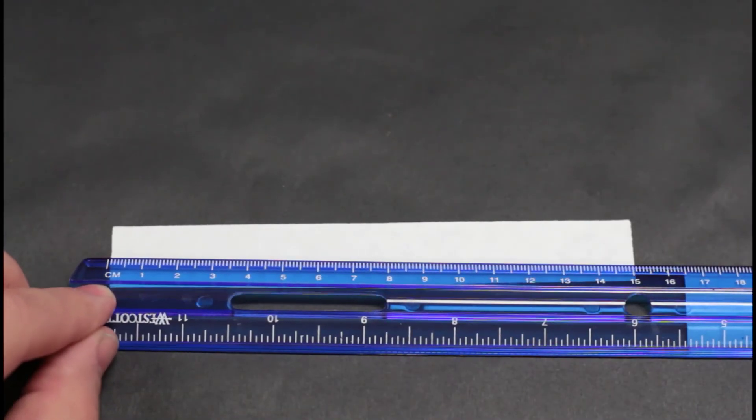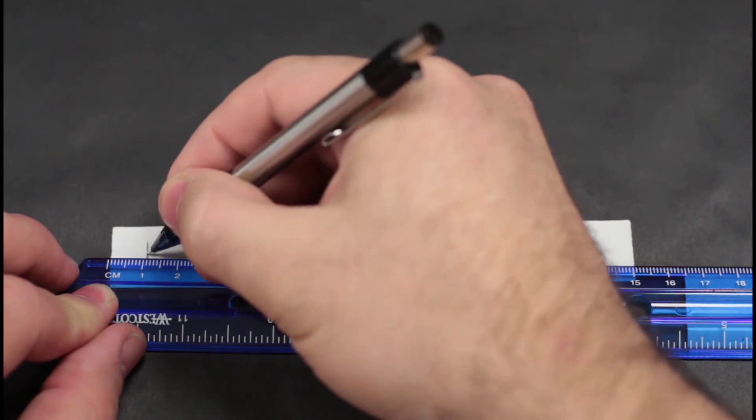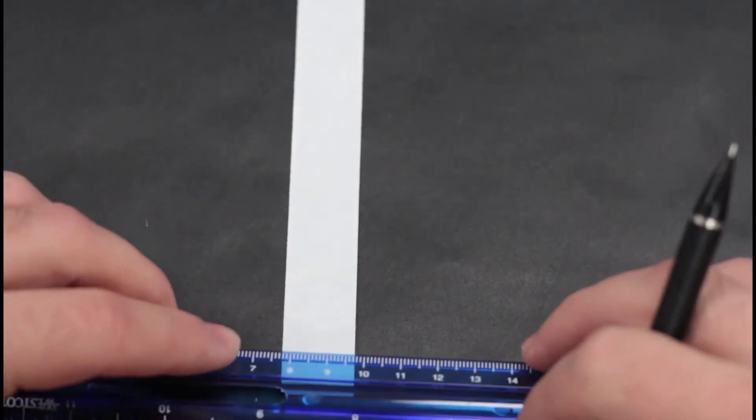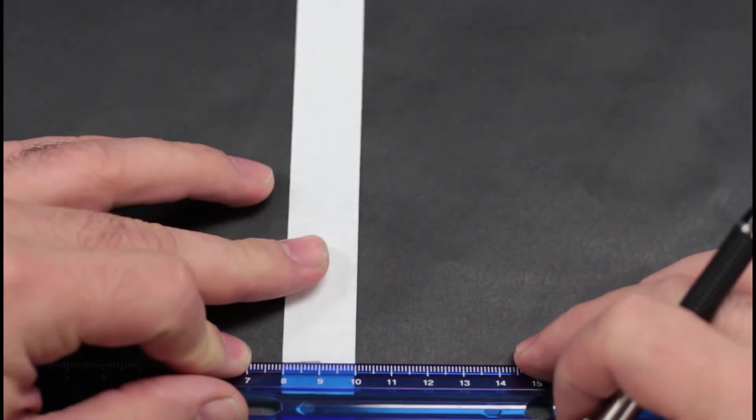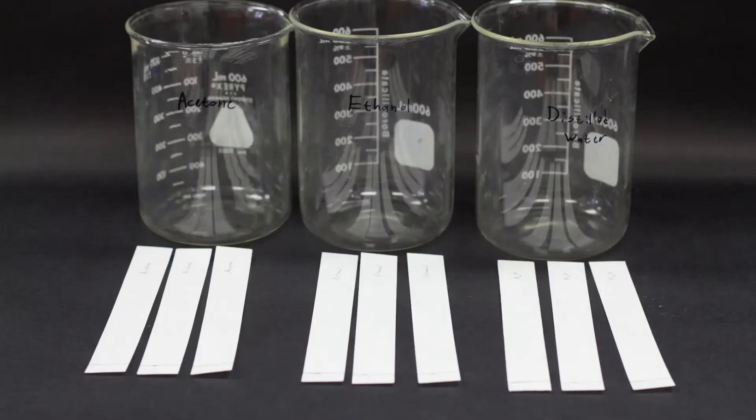The steps of our procedure go as follows. You'll select three ink samples to use for the chromatography. For each chromatography paper, use a pencil to mark a line straight across one centimeter from the end. It must be pencil because the pencil lead will not interact with any of the solvents, so you'll still be able to see it after we do this experiment.